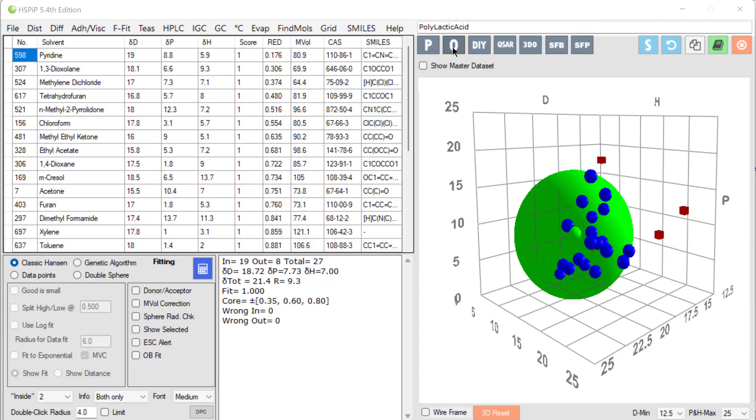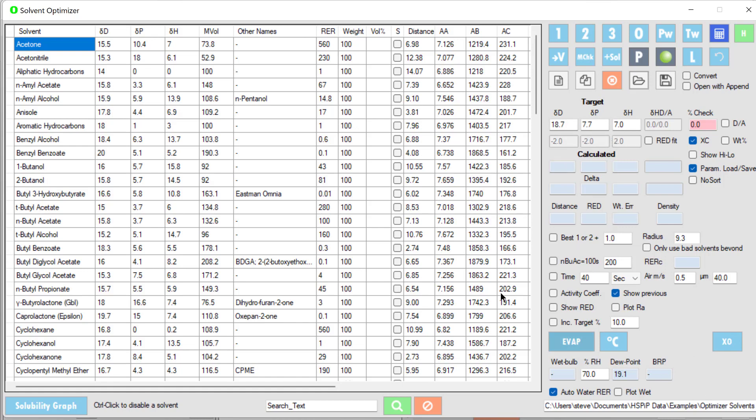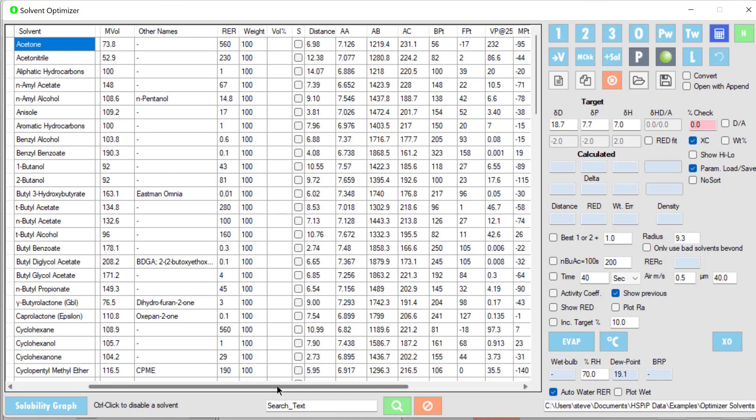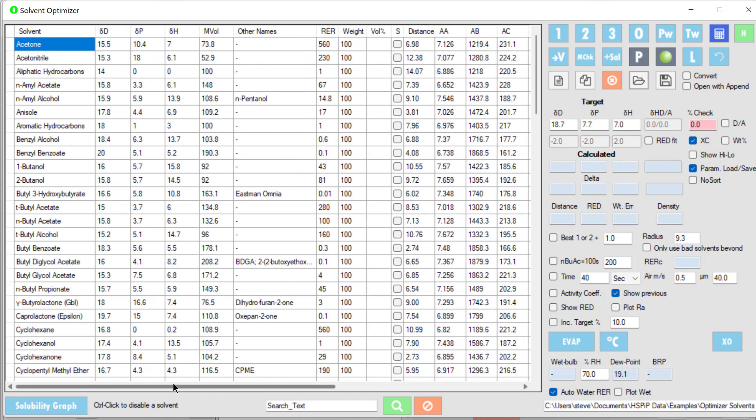We click the optimizer button and find the solvent optimizer with the target 18.7, 7.7, 7.0 automatically set. We want to find solvents which are close in HSP distance to that target. The optimizer solvent set is a convenient list with lots of data: the D, D, D, P, D, H, molar volume, relative evaporation rate, Antoine coefficients, and things like boiling point and flash point—very useful data for general optimization.